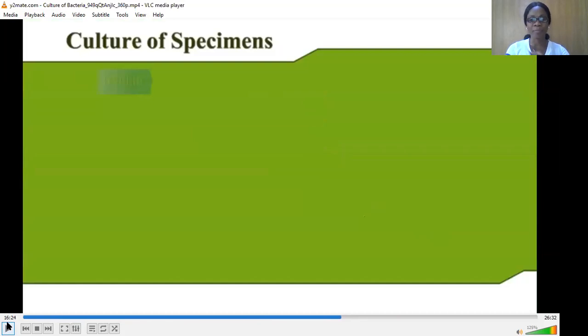Before we go on, I purposely paused that video. If you are watching this video with keen interest, you notice there are three words that keep coming up. The first one is sterilize. The second one is incubate. And the third one is label. Before anything is done, please ensure you sterilize your working area. Sterilize all equipment you are going to use, your inoculating wire, your inoculating loop, even the tip of the test tube and flask need to be flamed.